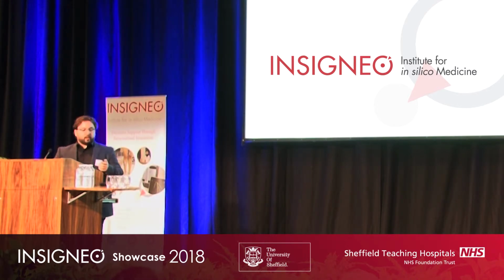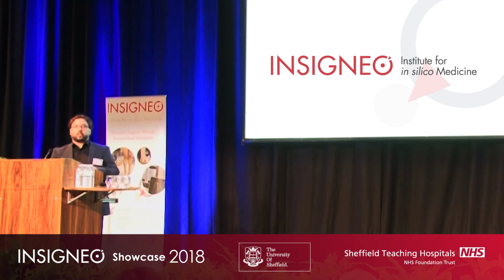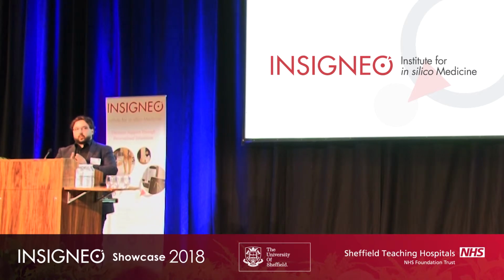So the idea is that the algorithm provides the displacements in the nodes of this grid, which is overlapped to the two images, and then we assume in this case linear displacement within the cell of every grid. So if we use a small nodal spacing, so the size of the grid, we get many measurement points, but then we may pay, as we will see in the next slide, and as Andrew showed for the DAC application, that the precision of the technique is reduced.